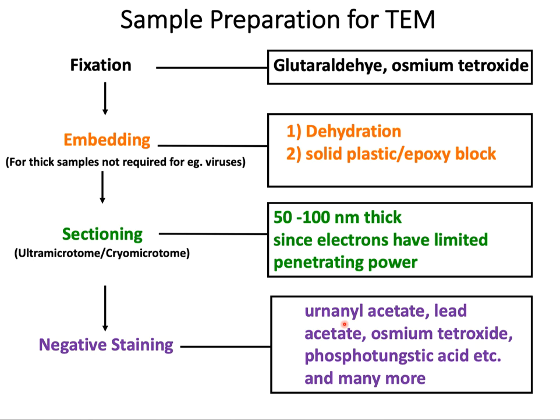This will give the electron micrograph the black and white contrast of varying degree. The area with lots of stain bound will be very dark or black, moderately bound area will appear gray, and the area without any bound stain will appear white. We will visually see this in the next slide. Note that all electron microscopic stains are called negative stain as they are negative or dark as the electrons can't pass through them, in contrast to a light or positive background through which the electrons pass without obstruction and hit the detector.